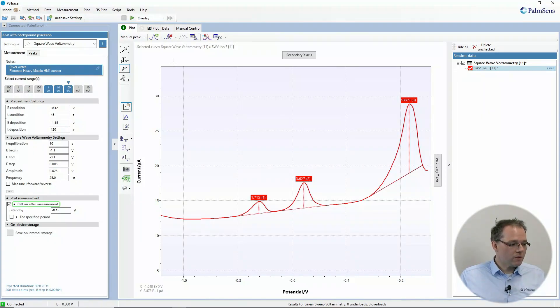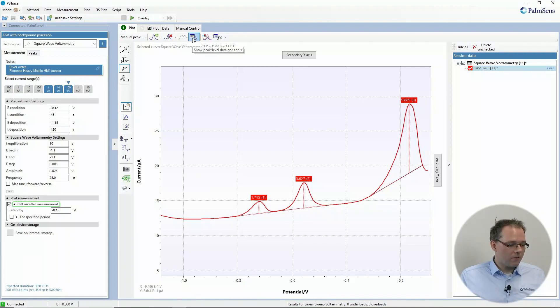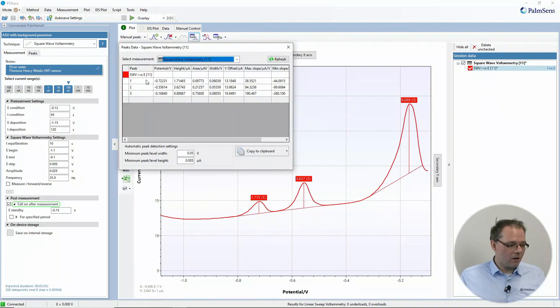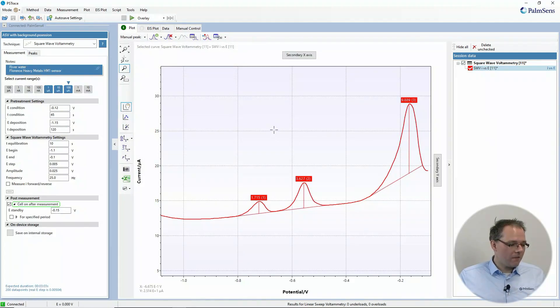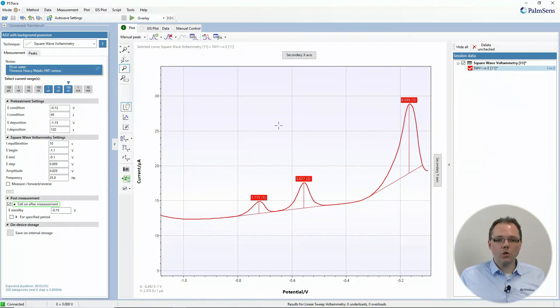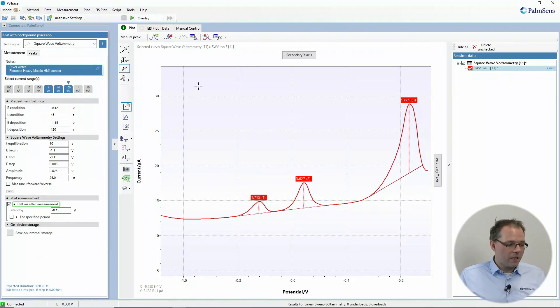You can also get a summary of your peaks if you just click on the peak window. But that is if the Auto Peak Detection is doing a good job for you and you're happy with that.